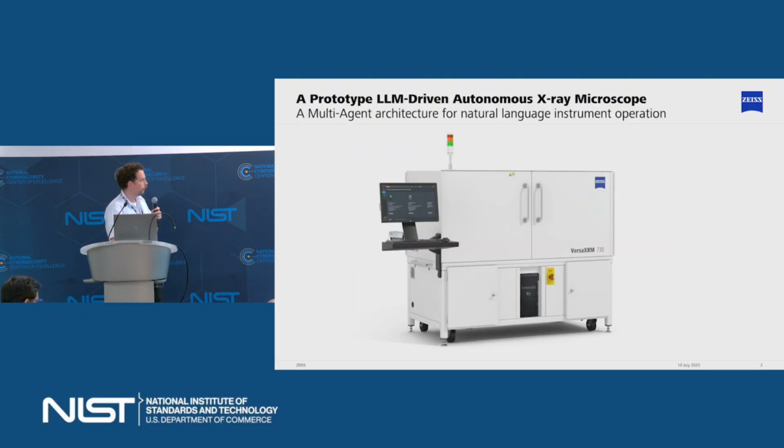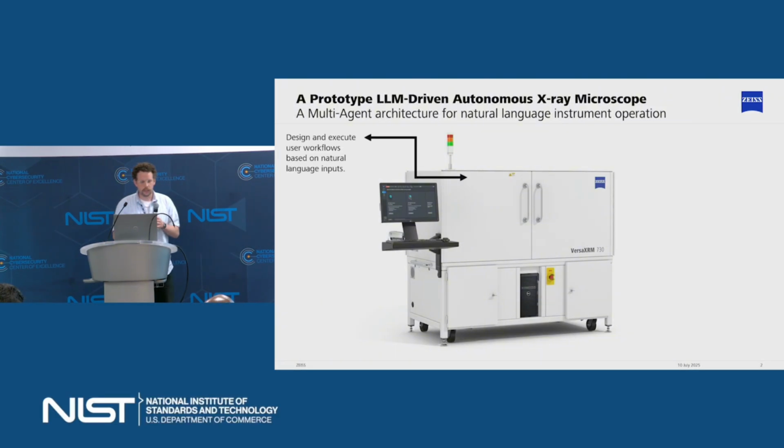So the prototype that I'll show you today is, also someone mentioned yesterday that they hadn't heard the word multi-agent very much at this workshop. You're about to hear it a whole lot. So this is a multi-agent, large language-driven prototype for controlling an X-ray microscope.